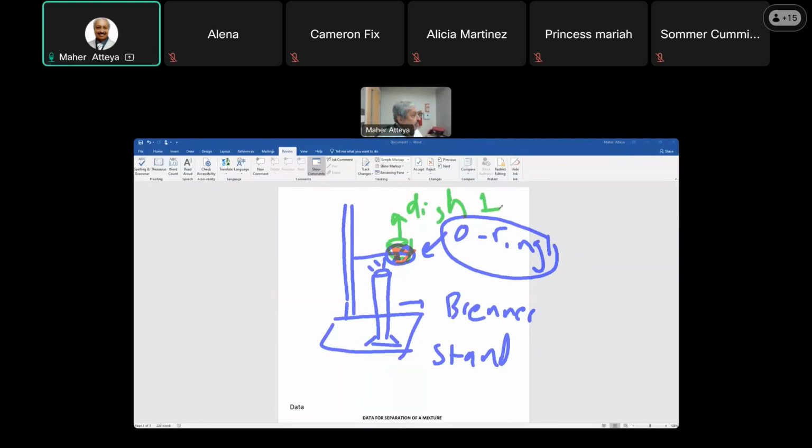First, we have to get rid of what? Of ammonium chloride. Ammonium chloride sublimes, that's the first one we have to get rid of. We separate ammonium chloride by heating slowly first, and then you heat a little bit more vigorously, but not too much heat, just enough to drive all the smoke out. You will see ammonium chloride going out as a big smoke. Are you following me here? So you heat until the smoke stops, then that will tell you that ammonium chloride is driven out, is sublimed out of your mixture. There's no ammonium chloride inside your mixture, correct?